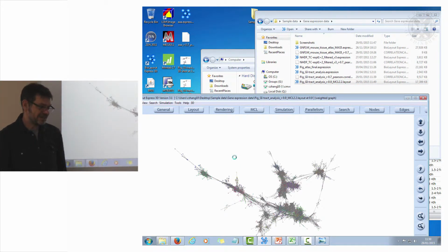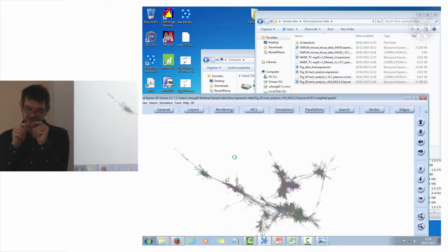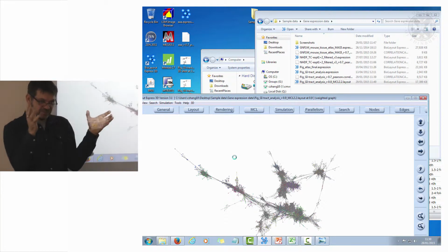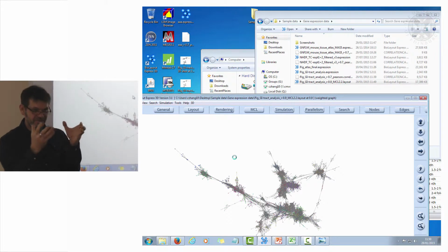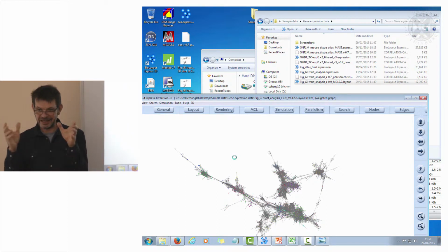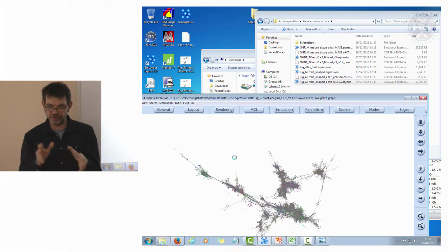Okay. A layout file is different from the input file because it stores where everything is. So it'll be identical to the graph you've just been working on. If you reload the data from the start, you should produce the same graph, but it may look slightly different because the layout algorithm is a random generator and it will work out what is best. So if you save a layout file, it's exactly the graph, and it saves you the time and effort of redoing it. It'll save your clusterings and the work that you did on it, so it'll be an exact copy of what you were working on.